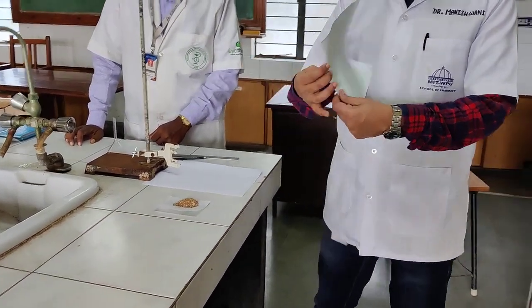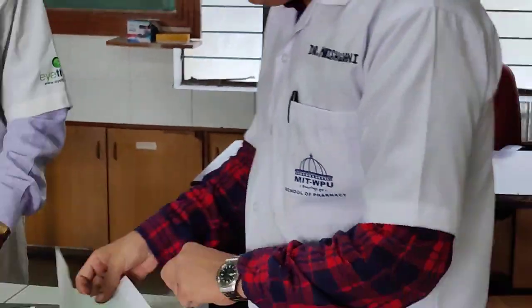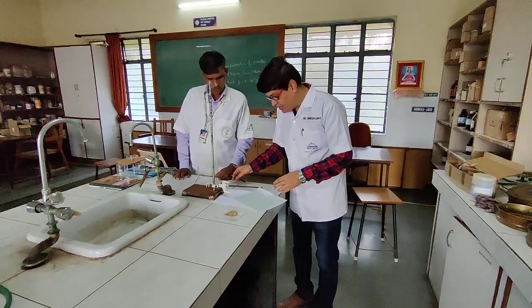So if you can see over here, this is the way that you are going to mark the circle. After marking this circle, you are going to draw the diameters alongside it.